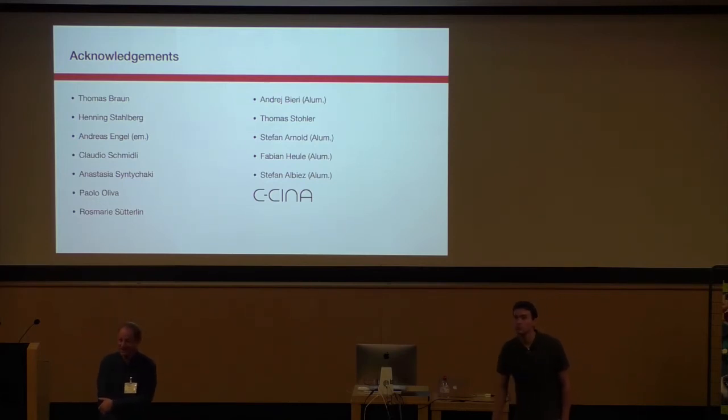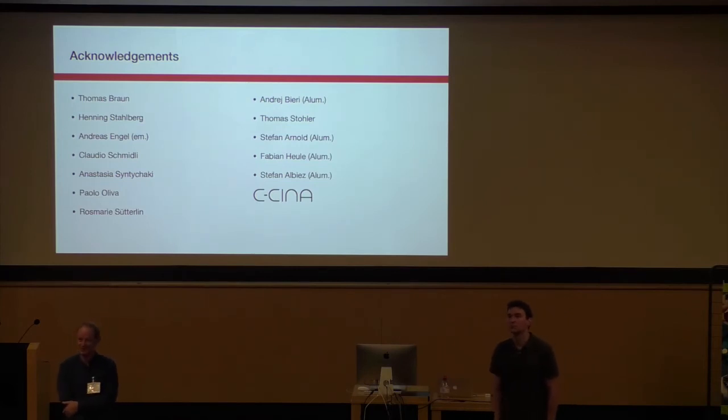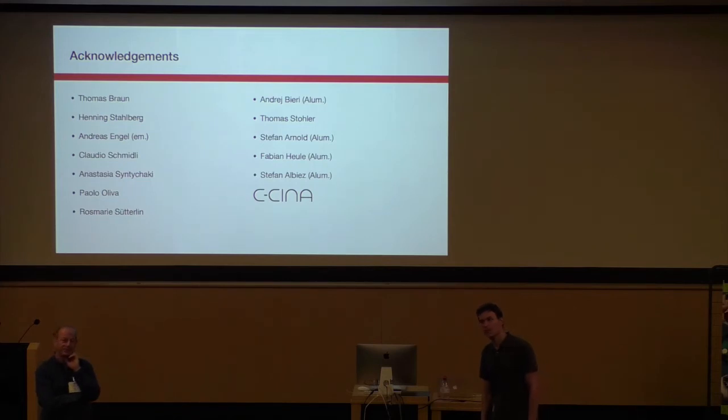Hi, really interesting talk. Have you done any comparisons? If you just take, for example, the purified ribosome or electrophoresis or whatever, have you done any comparisons between how much concentration of sample you need for your system versus on a Vitrobot or on a standard environment? It depends on the sample, it varies, but usually we need lower concentration. Especially if your protein tends to stick to the filter paper, you sometimes can really dilute it first with buffer, because otherwise it looks almost like 2D crystals. But it's really highly dependent on the sample, but usually lower concentration for us than what you would use on a Vitrobot.